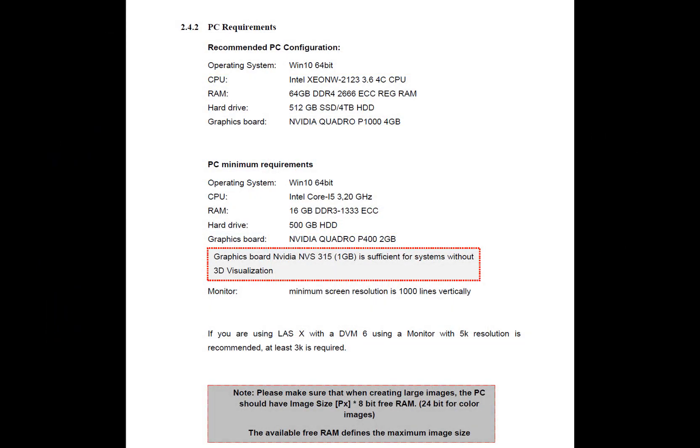Now that we've gone over the process to update to LASX version 5 let's talk about some of the changes that have happened with this version. First I want to talk about an update to the recommended computer specs with a faster processor and more RAM being the major changes.